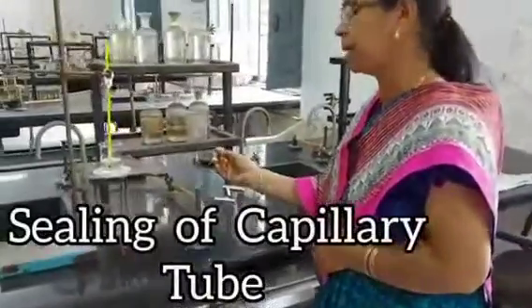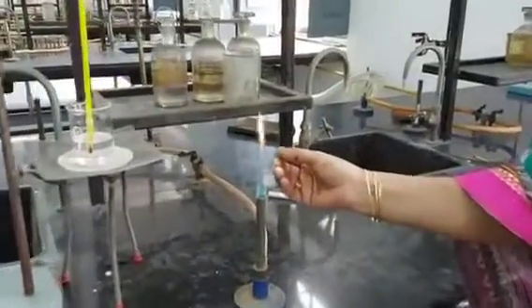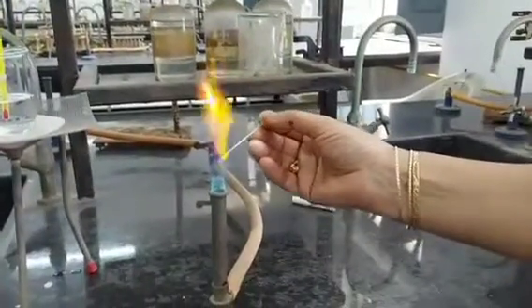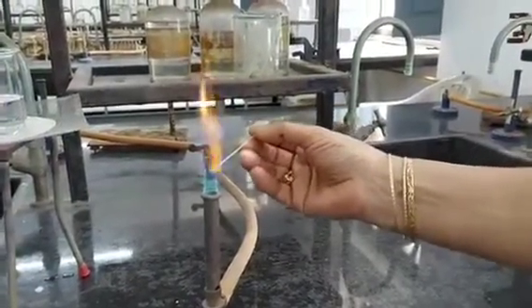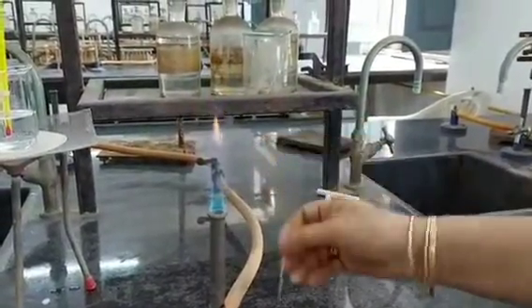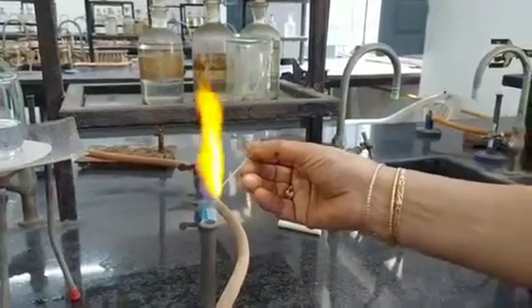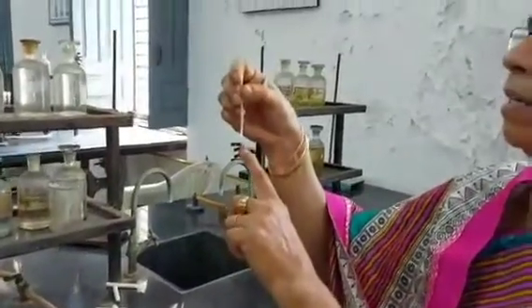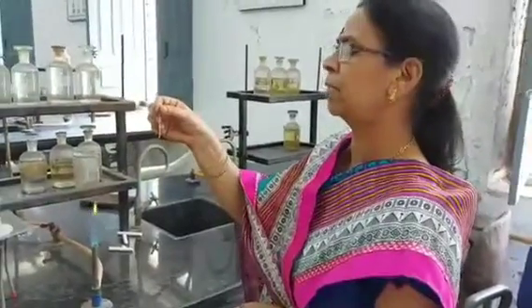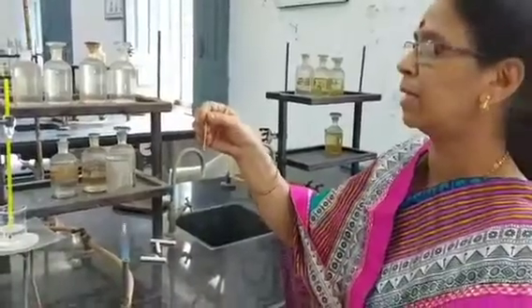Now since we have to take out the melting point, this is the way you seal the capillary tube. You take a small piece and then you just fuse it by slight rotation intermittently, and this is the way you seal one end of the capillary tube. Capillary is sealed at one end. Now you fill this with the prepared mixture of camphor and the given solute. First you have to find out the melting point of the pure solvent, that is camphor.